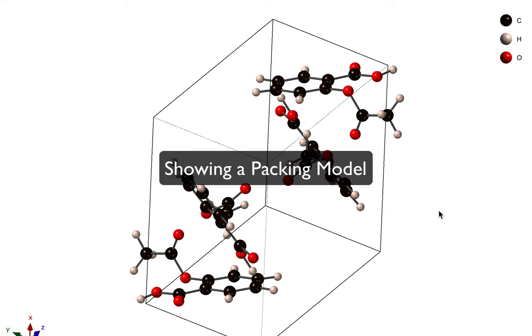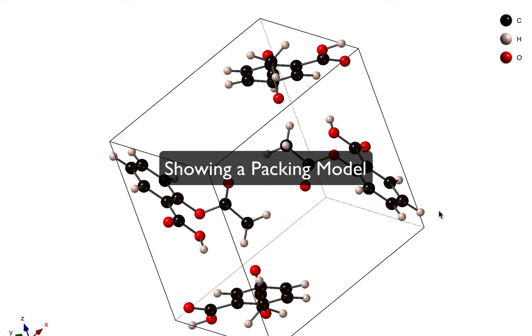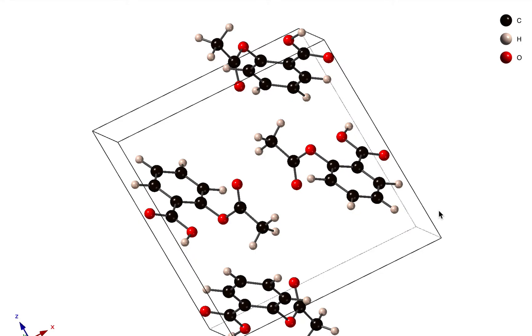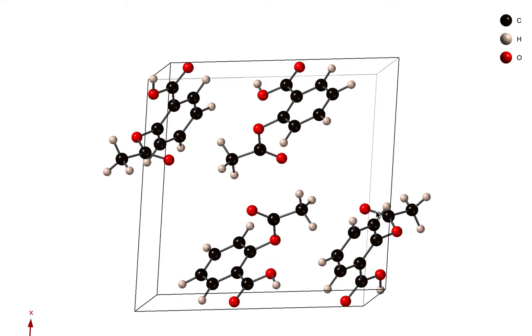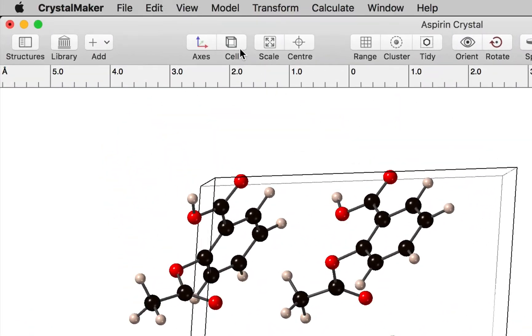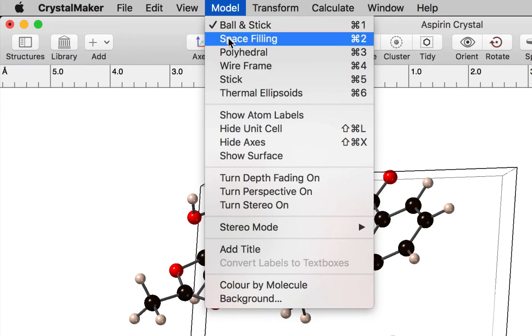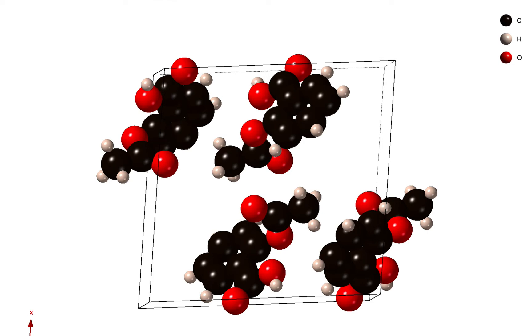One thing you might want to just do is maybe change the display from this basic ball and stick mode to some kind of packing model. CrystalMaker comes with some preset model types, so we can switch to a space filling model. Now these are using our covalent radii.